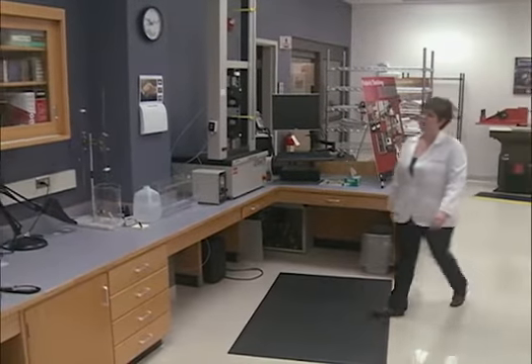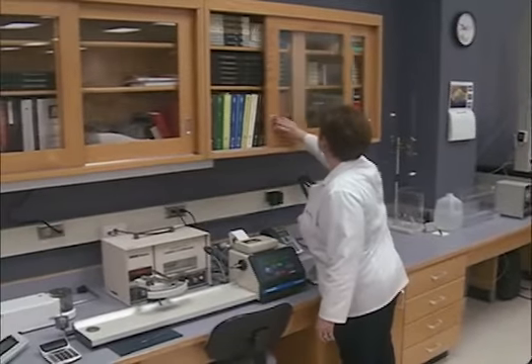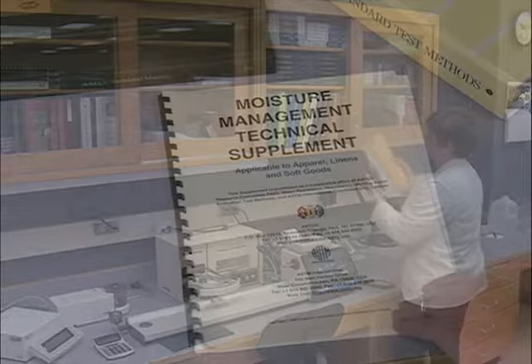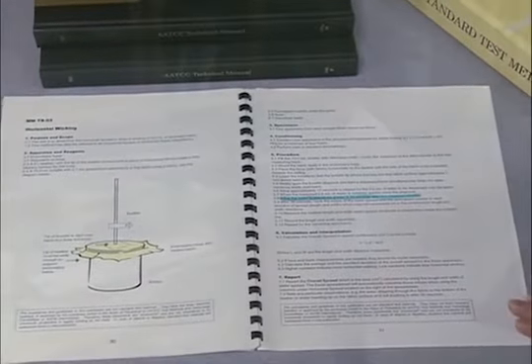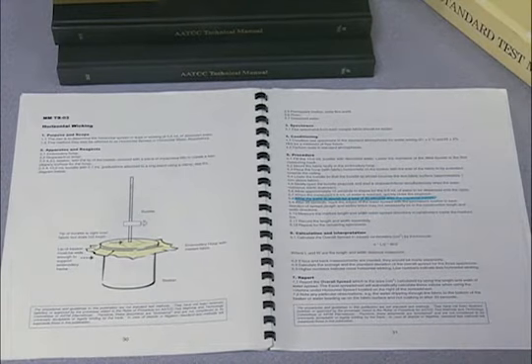An existing AATCC test method is integral to judging whether a fabric has one major attribute of moisture management: absorbency. In fact, one of the new moisture management test methods calls for a determination of whether a fabric meets a prescribed absorbency threshold as measured by AATCC Test Method 79.